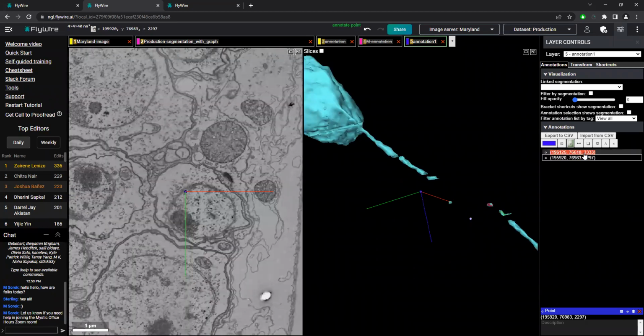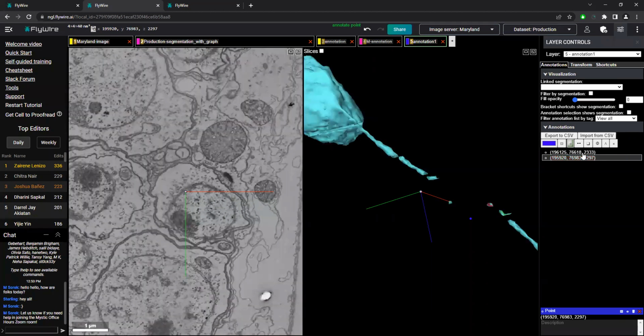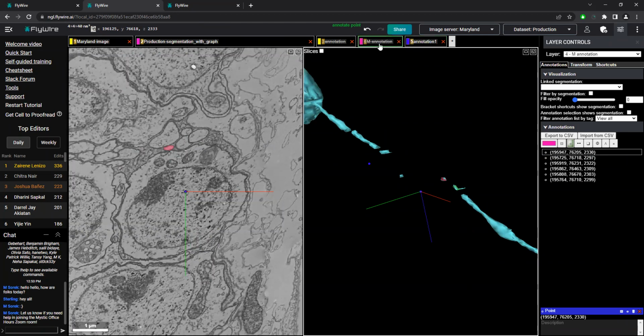That way you're not scrolling through 12 or more slides of a whole bunch of stuff that your eye can't easily track. And here, we can more quickly see by toggling between these two. Just an example, but in your case for this one, because we had these three very easily recognizable spots here, it was pretty easy to just drop the breadcrumbs like we did here.